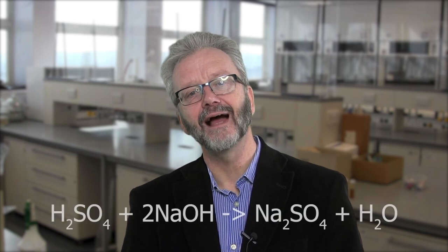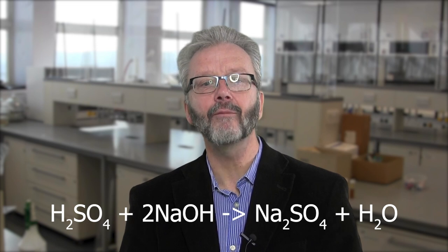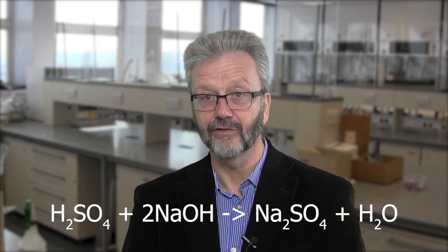I am going to react a solution of sulphuric acid of known concentration with a solution of sodium hydroxide of unknown concentration. Here is the reaction. We can see that two molecules of sodium hydroxide react with one molecule of sulphuric acid.